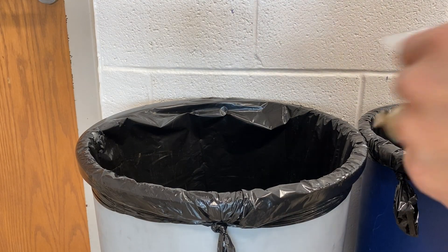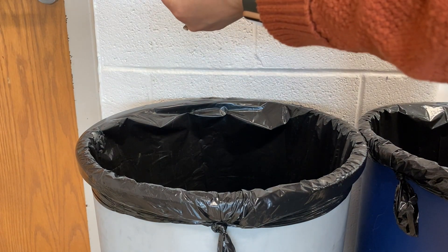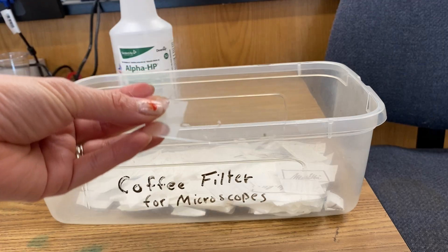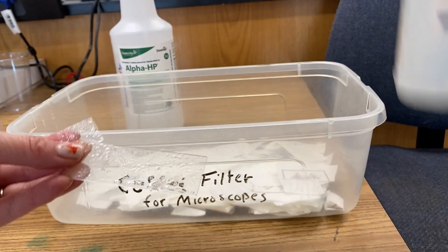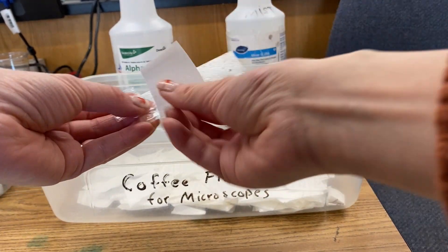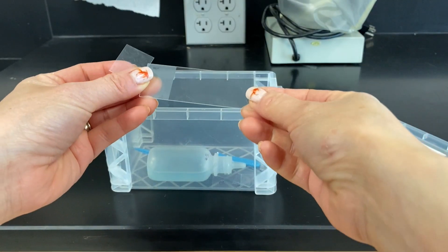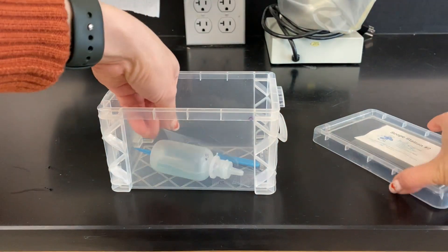To dispose of your Elodea leaf, simply take it and drop it into the trash. Then clean your slide with a little bit of disinfectant and wipe it with a coffee filter. Then place your slide and clean cover slip back into your kit.